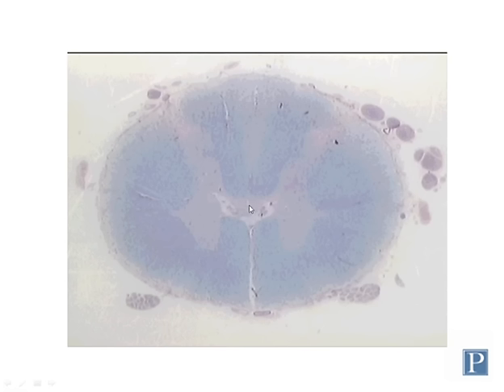In the middle of the region of the central gray commissure, you can see the tiny central canal, which is a remnant of the ventricular system of the nervous system that contains a very small volume of the cerebral spinal fluid. So once again, we have dorsal or posterior horn, ventral or anterior horn, lateral horns, central gray commissure, and the central canal. Those are the main anatomical features of the gray matter that you need to know.